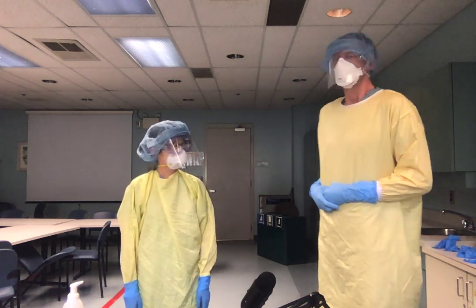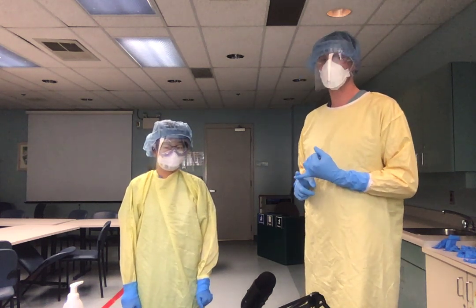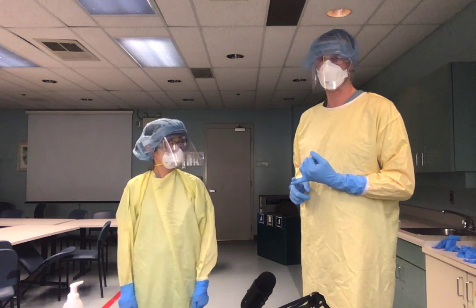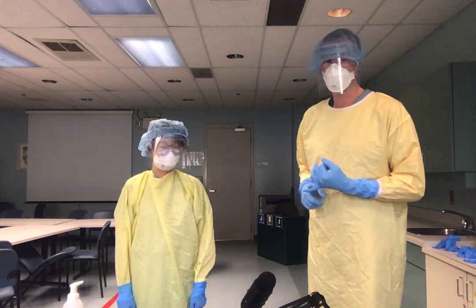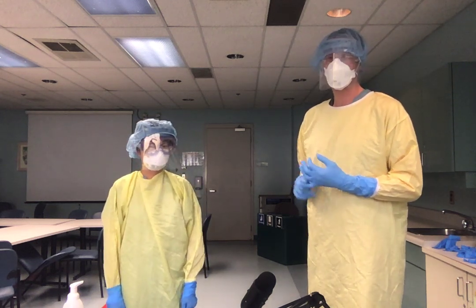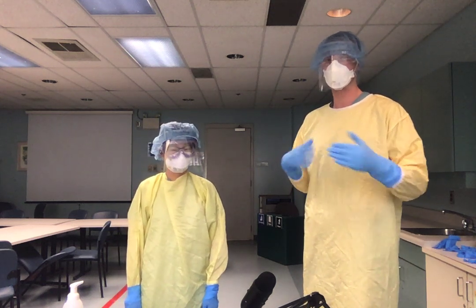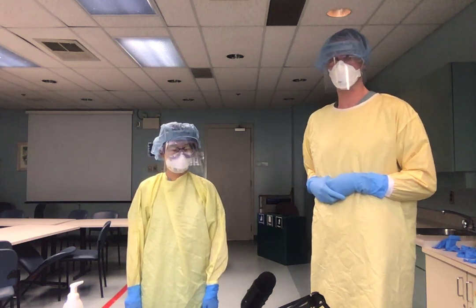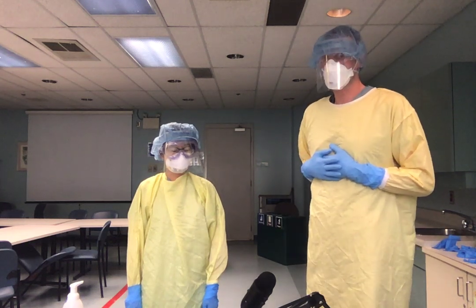Okay? So a key detail here, when we're taking off our PPE, we need to do it under the supervision of another staff member. Some people call that a doffing buddy. You might hear of it as a safety officer, or one of the runners might do it. Everybody should be able to guide another person through taking off their PPE. That's really the purpose of this video, to teach you guys the proper process. I'm going to be leading this very much in a Simon Says fashion.